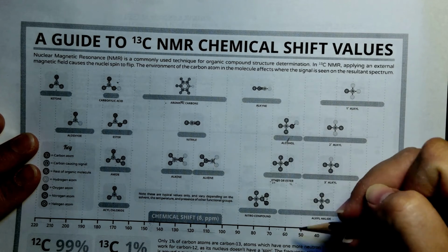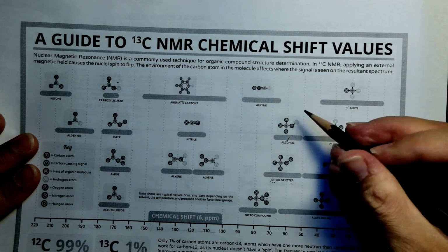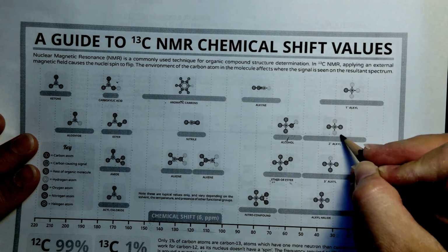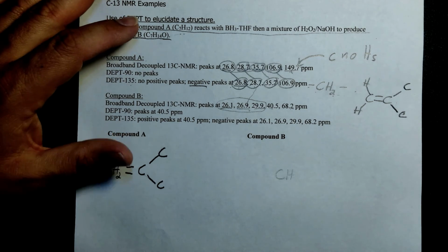That's in this region. But a carbon that's 2 carbons away from an O is going to still be upfield, but a little bit over. The farther away the carbon gets from the O, the farther it's going to shift back upfield. And that even seems to grow exponentially. It happens quickly. Once you move 2 carbons away, it almost just goes back to normal. It doesn't even sense the oxygen.